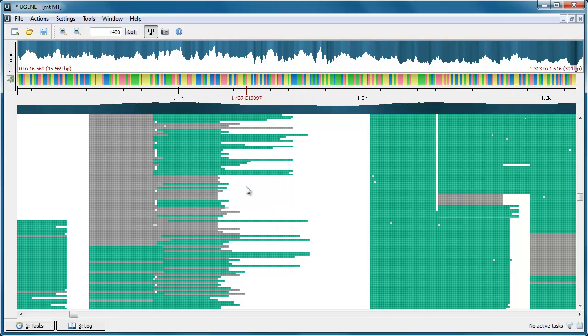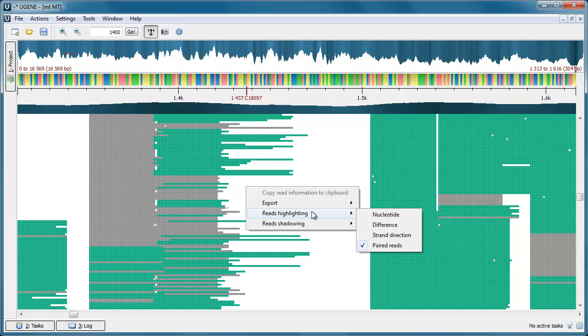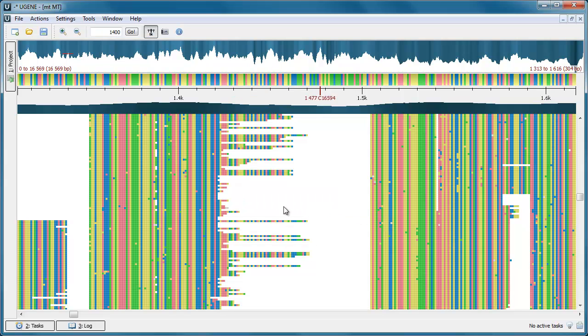The default highlighting mode is the Nucleotide mode. When this mode is enabled, all nucleotides are highlighted in different colors.